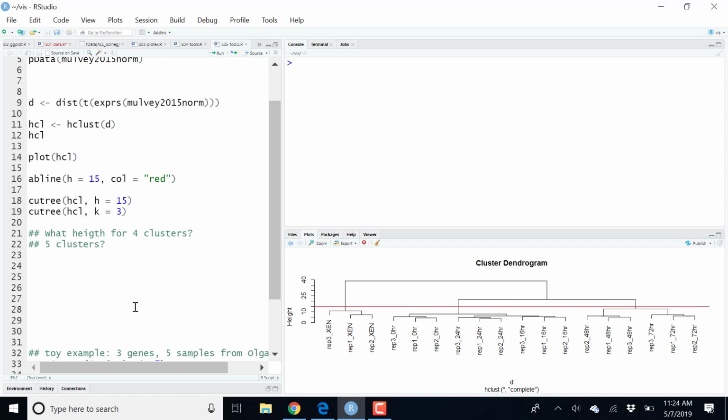There is this type of object that is the hierarchical clustering object, but we also have dendrogram objects that store the actual tree, so you might need to convert from one object to another, depending on what you get when you read it in.